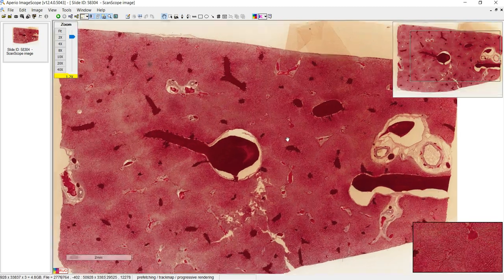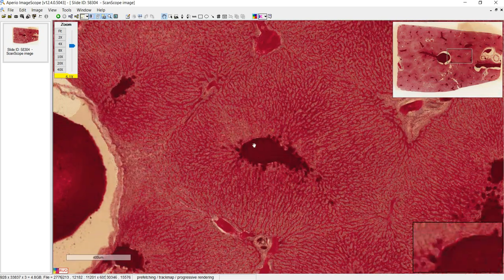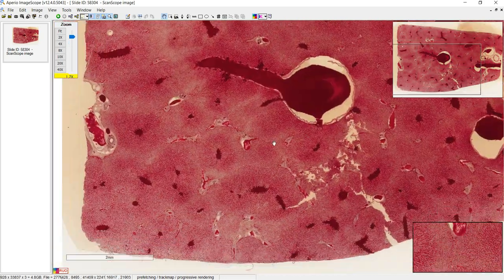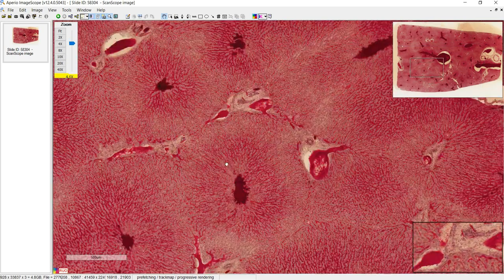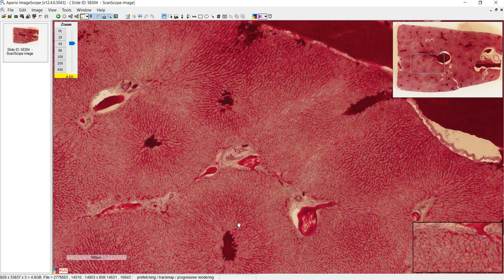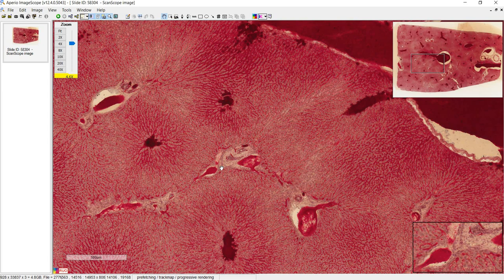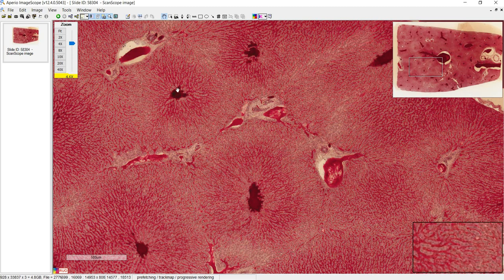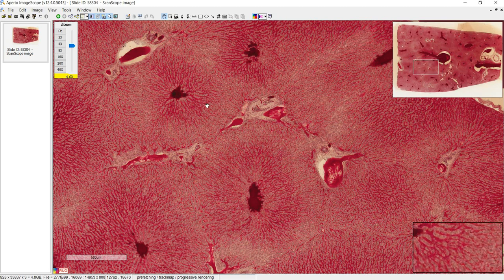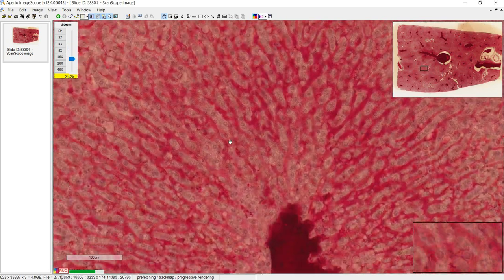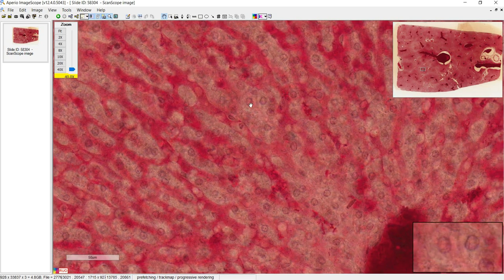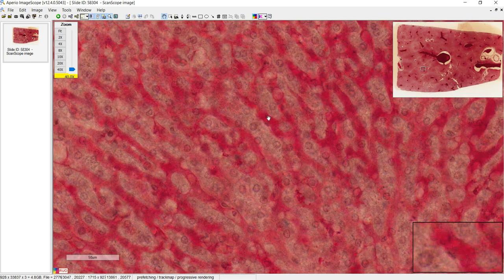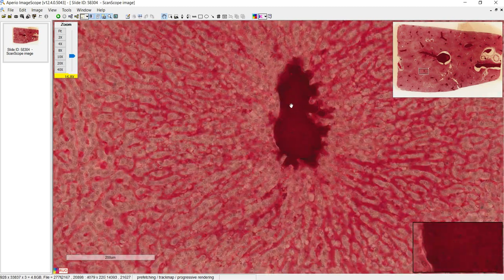This is another liver slide where the central veins are very distinct and it's easier to see the lobules. On higher power, unlike the other slide, you can clearly see the hepatocytes and the red spaces that are probably the sinusoids, with all the blood flowing towards the central vein.